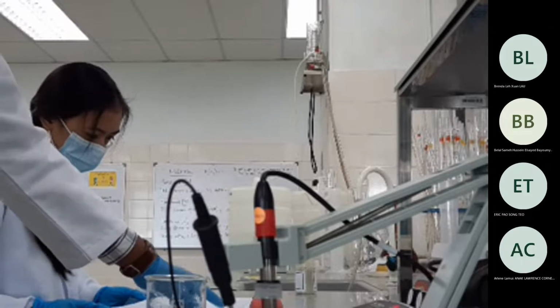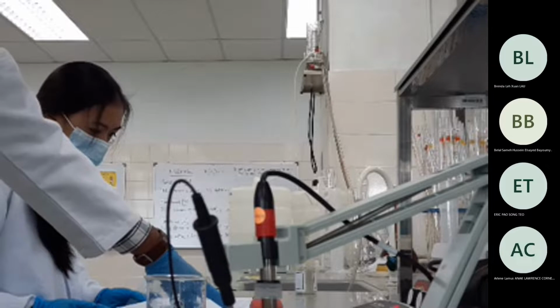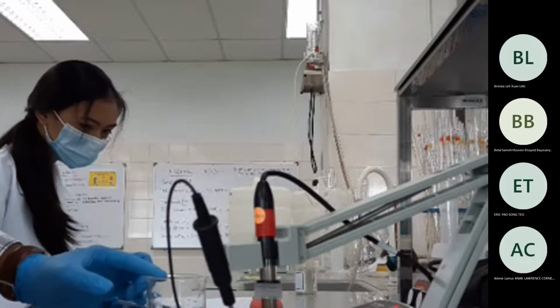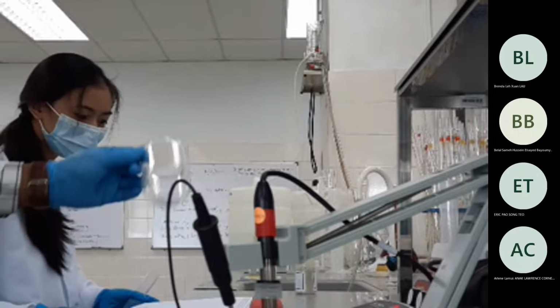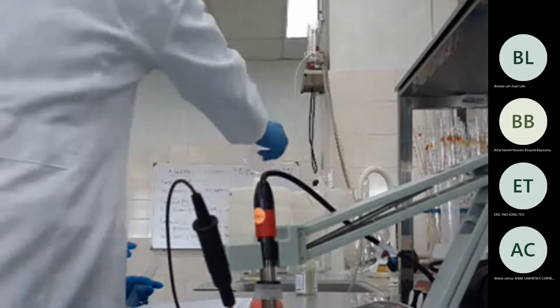These are in fume hood 5 and fume hood 6. So you get 50 milliliter in this beaker and then 50 milliliter in this beaker, mix both together, and then that will be a buffer.